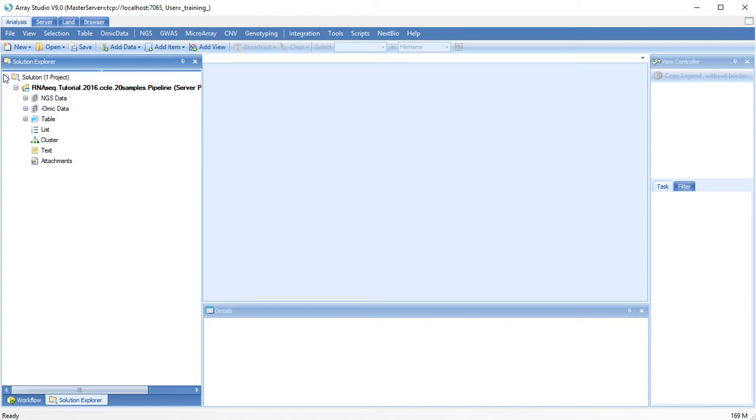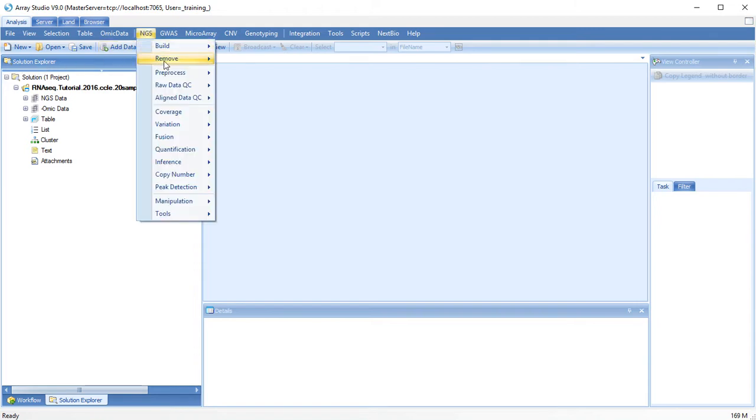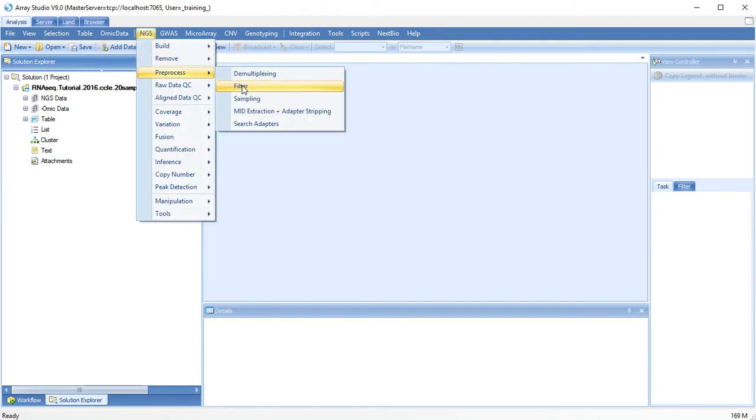Before aligning your RNA-Seq reads, they must be filtered for low-quality reads and adapter contamination. In Array Studio, filtering of your reads can be performed under NGS Pre-Process Filter.